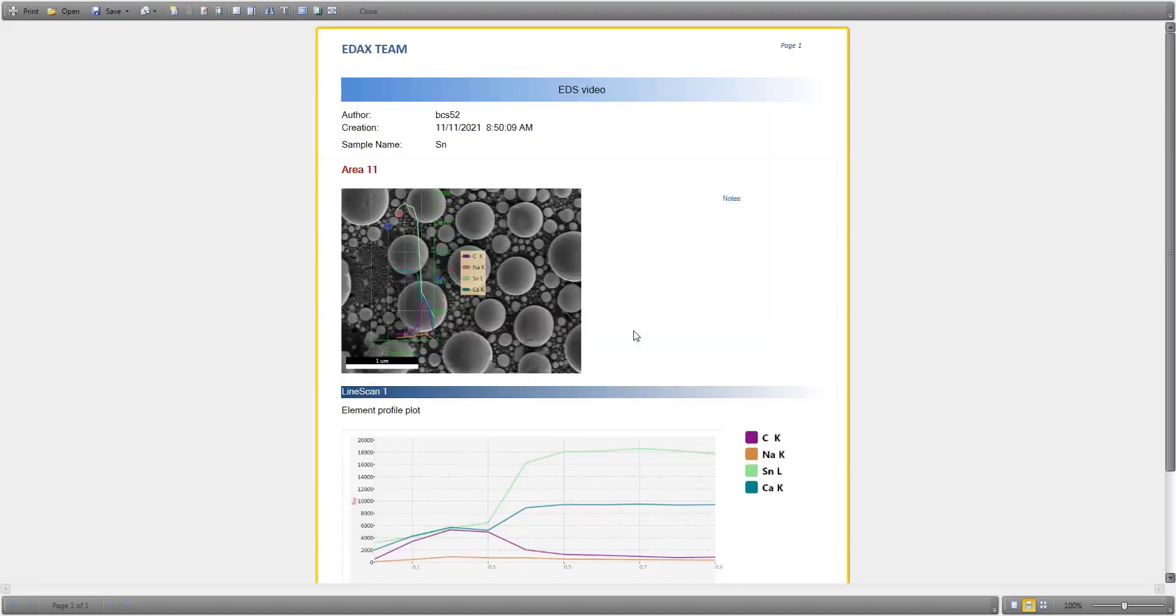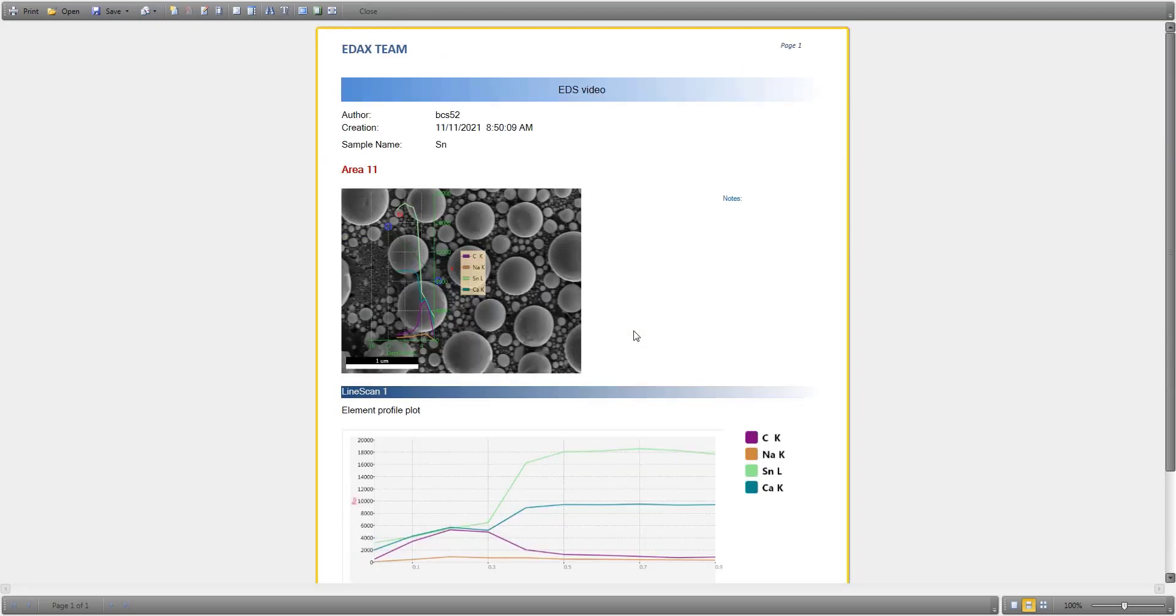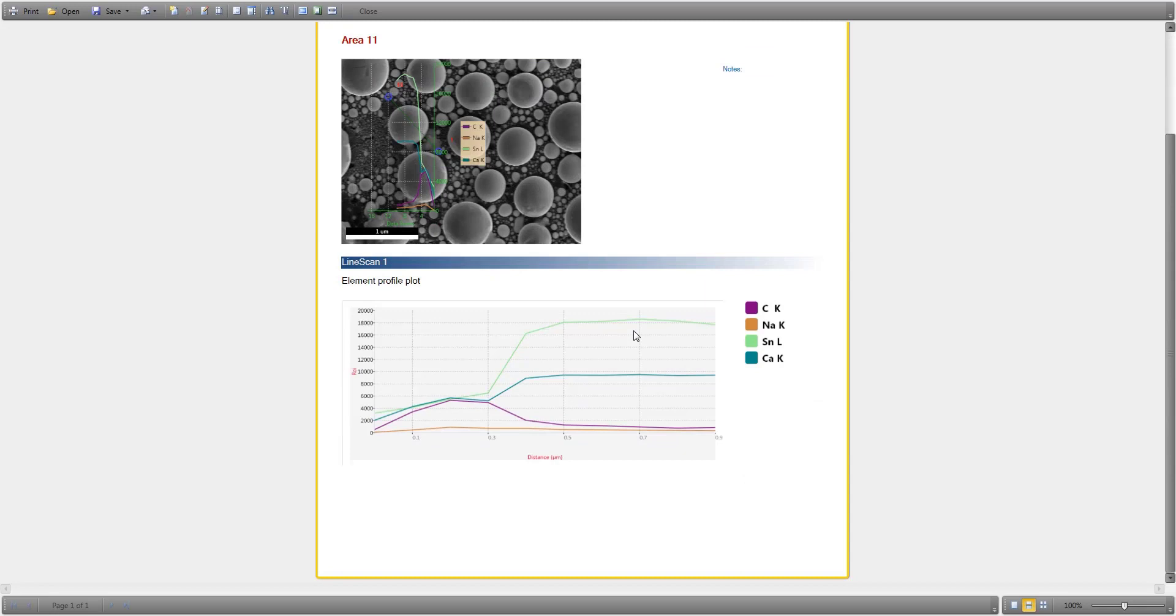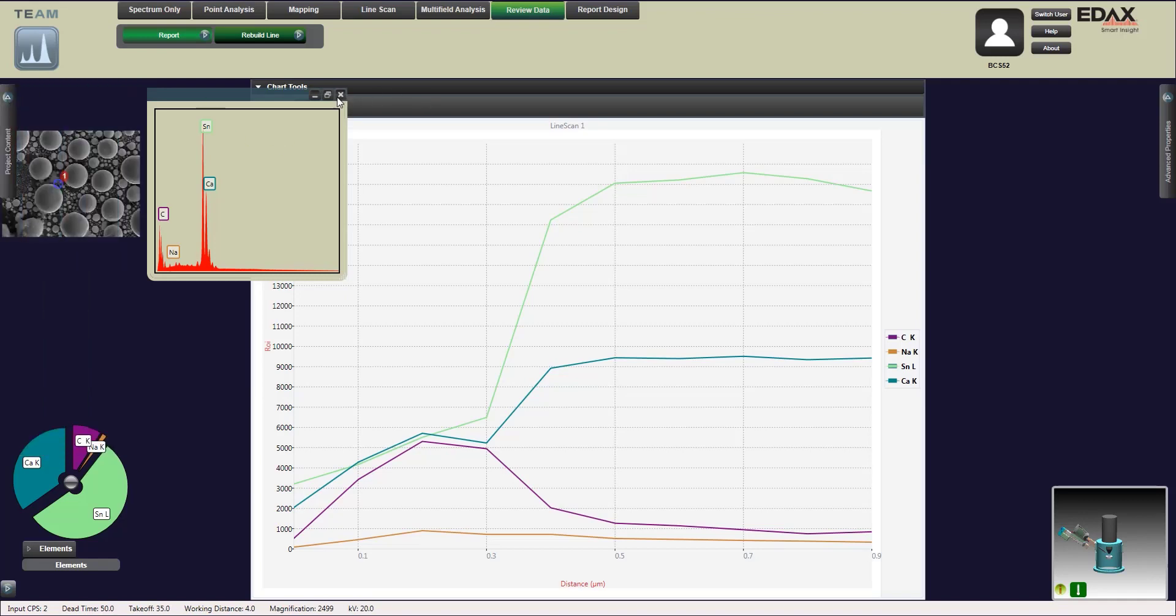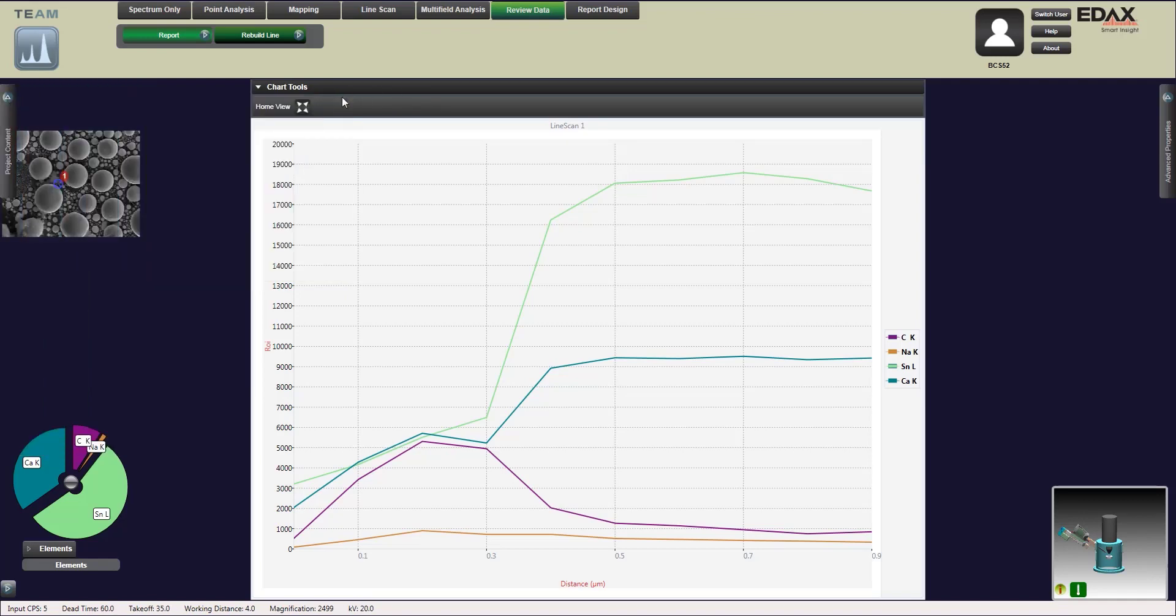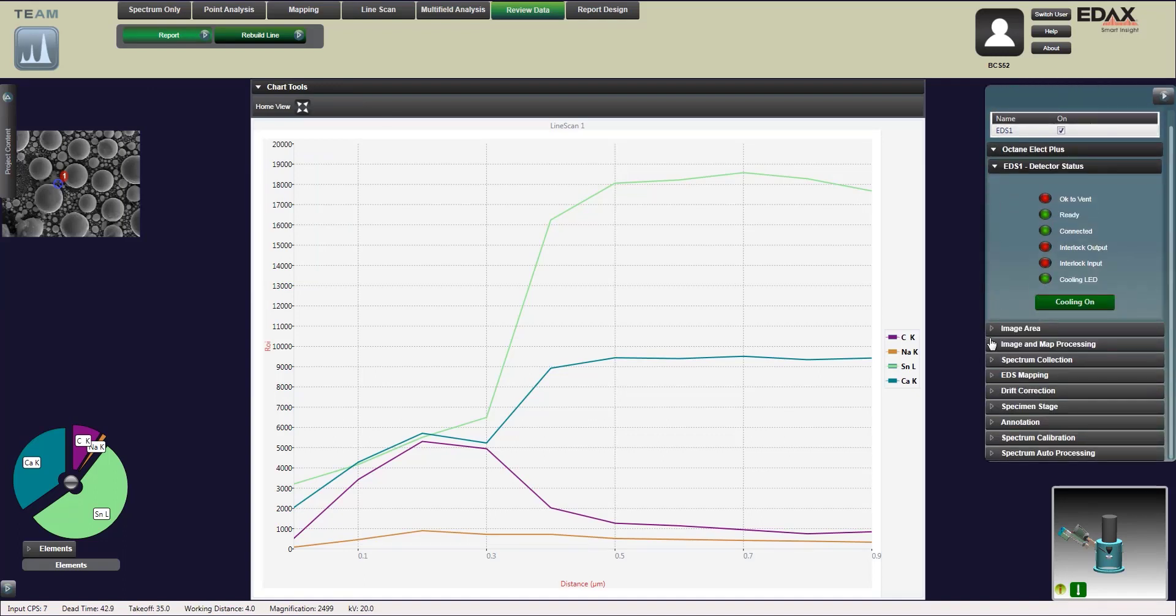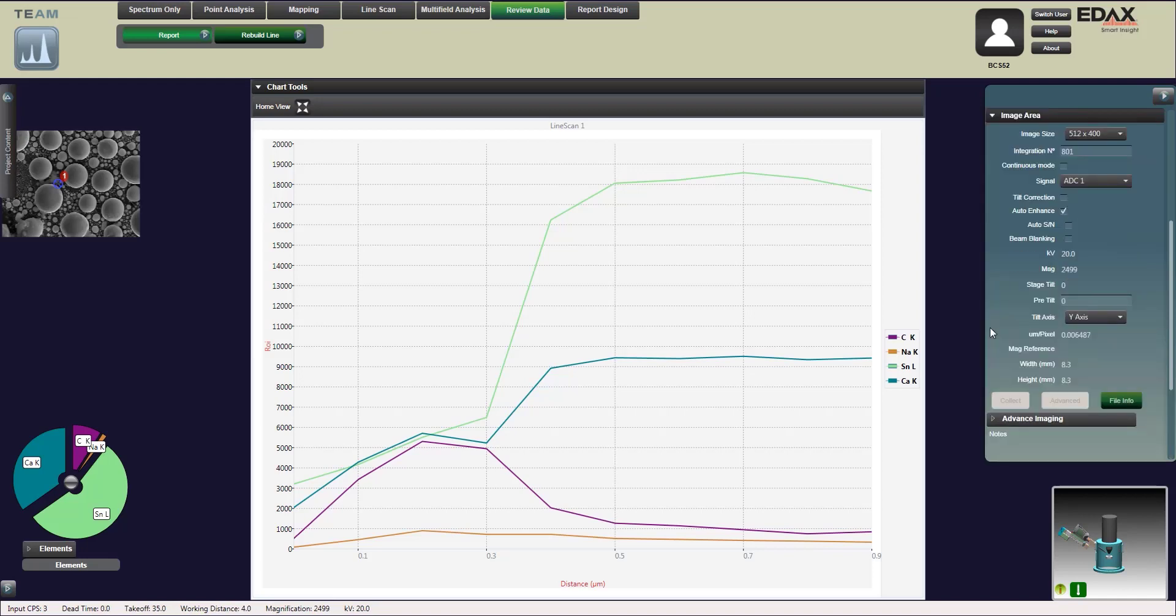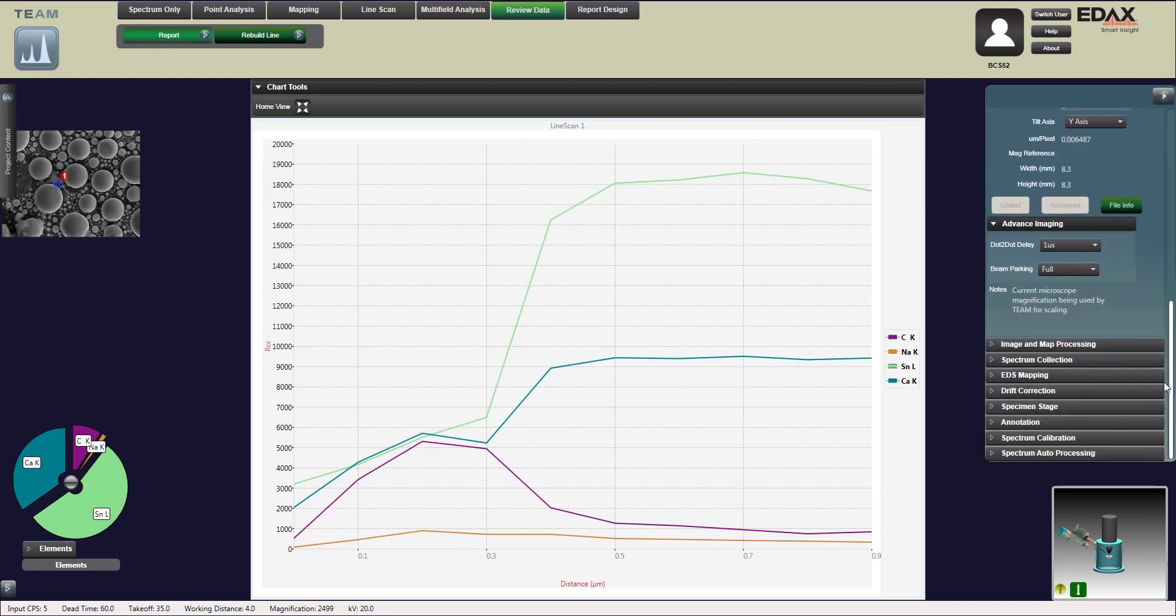Over here there are a couple functions that we can use. I'm not going to change most of these, but if you wanted to change amp time there is a section over here. It's easiest done really in the point analysis mode so you could just do a quick check by running a scan. But if you wanted to change the amp time this is where you're going to do it over here under spectrum collection. You can also change the clock here as well.